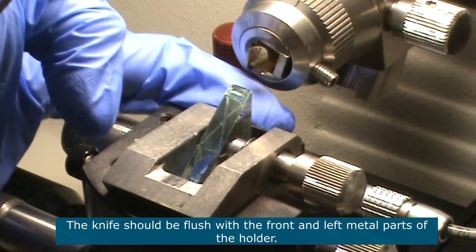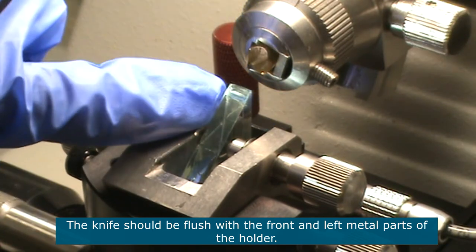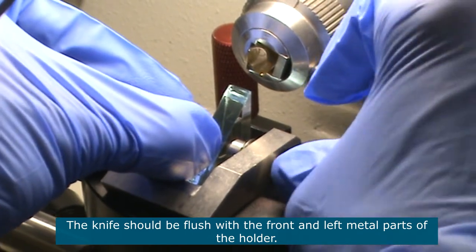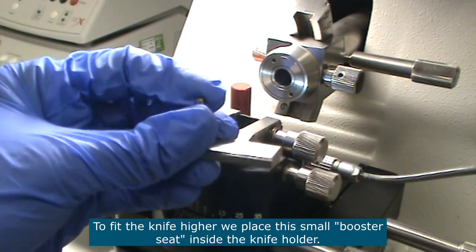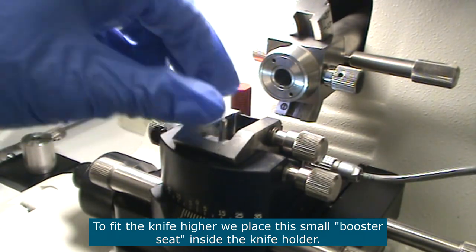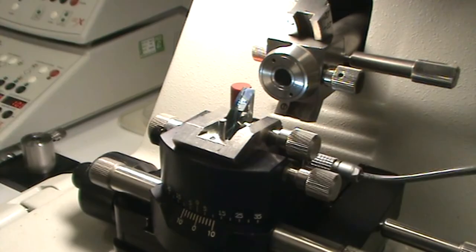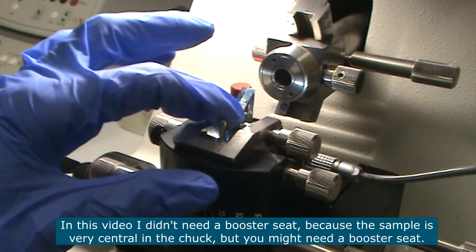It is important that this side of the knife is flat with this metal part of the holder, and that this side of the knife is also flat with this metal part of the holder — that's why you have to press it in position and then tighten it. If your sample is not positioned centrally in the chuck, you might need to have your knife a little bit higher in the knife holder. To make your knife higher, you use this thing here which we call a booster seat. In this video I don't need to use a booster seat because the sample is right in the center of the chuck, but you might need to use one.